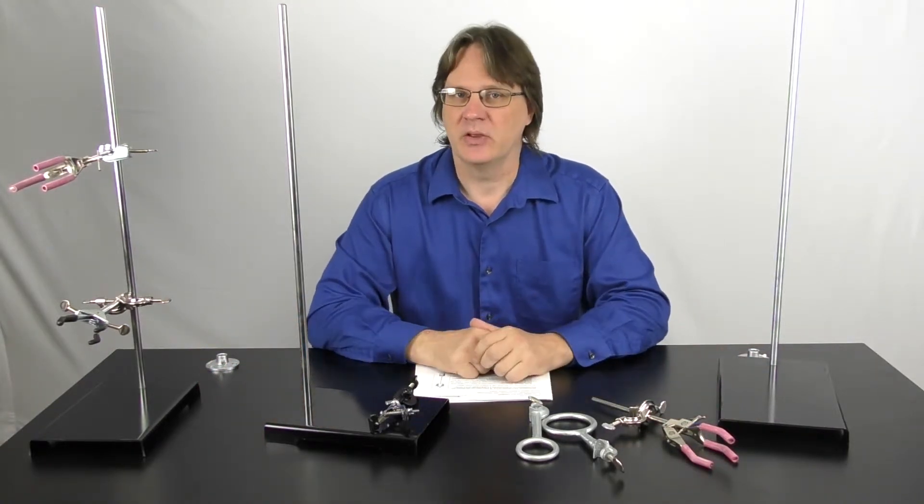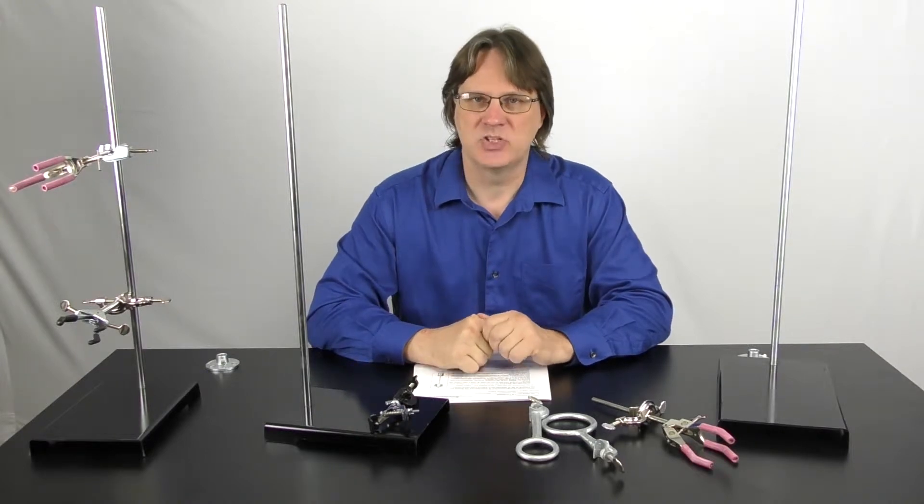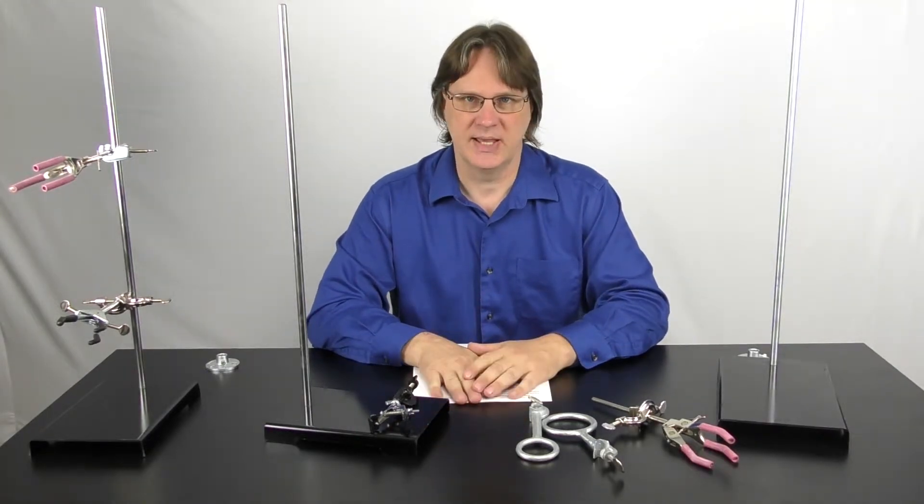Now, I'm going to show you a really simple and elegant solution to help you have a support for anything you could possibly do in the lab.